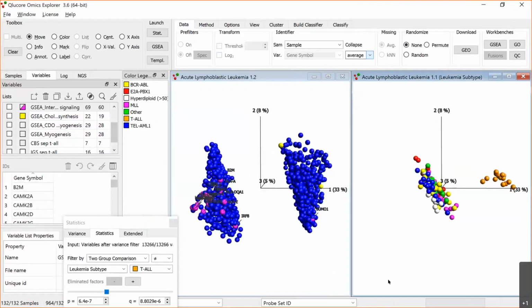The question is, do you recommend average? No, I don't recommend anything. That's your choice. That's why we have 4 options.